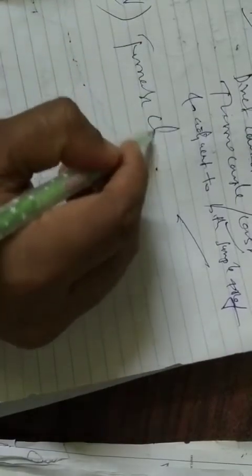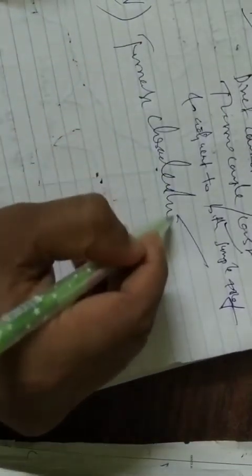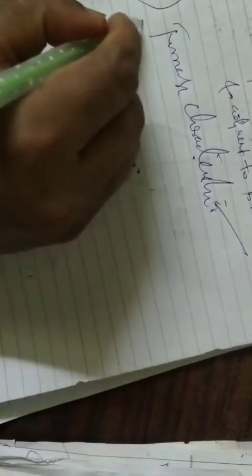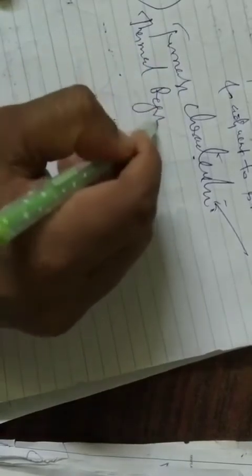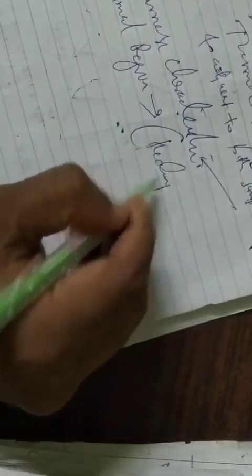Now the furnace characteristics. Under thermal regime, the heating rate is important. As we saw in the previous example, we kept 20 degrees per minute, so it is around 10 to 20 degrees centigrade per minute.